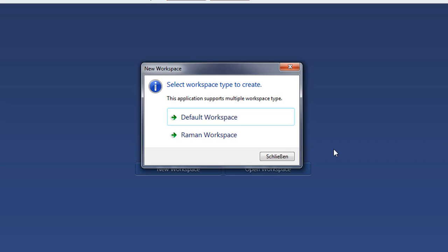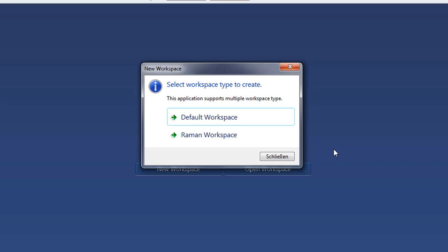You can select either a default workspace which works for all spectrometer configurations or you can create a Raman workspace which works for Raman system. I have a UVBIS system. Therefore, I decide for default workspace.